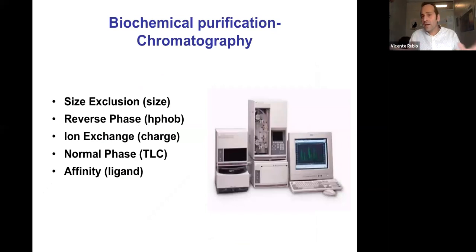Okay, so those two techniques mainly allow for protein-protein binary interactions, and have certain limitations. Because we need to have a specific library of cDNAs. In the case of protein chips, we need to clone them, express them, and purify them. So it's actually a challenge.